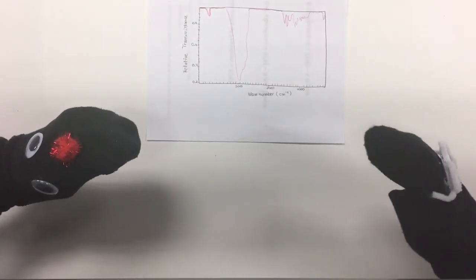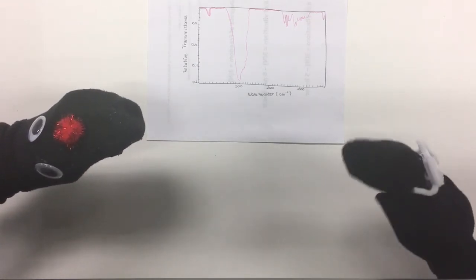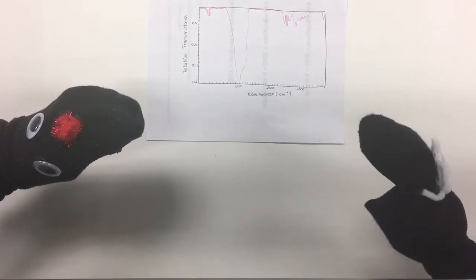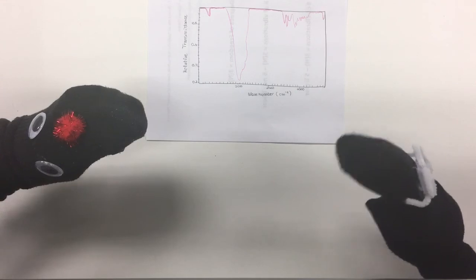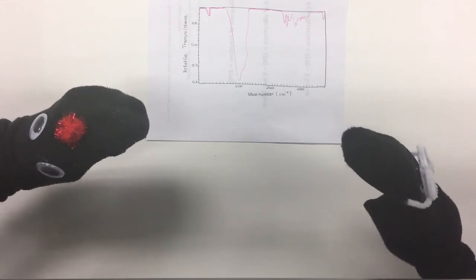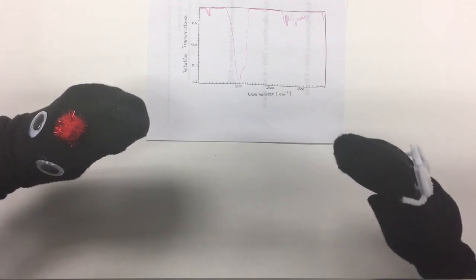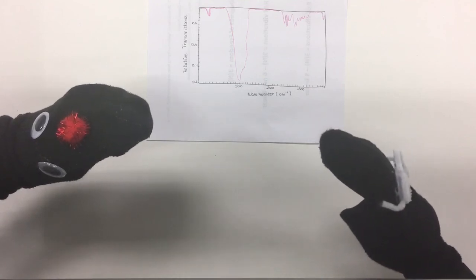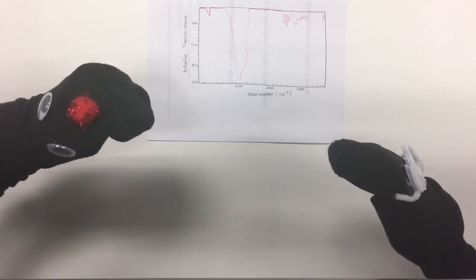So in my spectrum, I have a broad band at 3000 which represents the alcohol functional group. For some reason I thought my product was 2-butanone, but the presence of the OH band instead of the C double bond O band proves that it's really 2-butanol. Thanks, red nose puffs. You're welcome, glasses puppet.